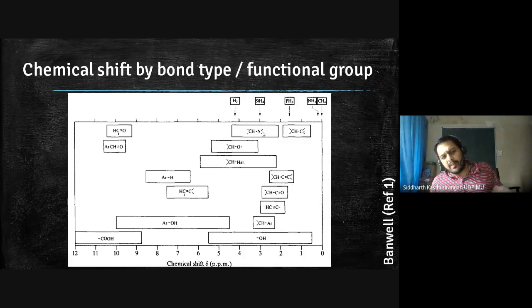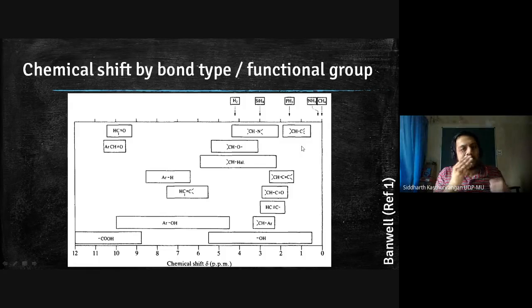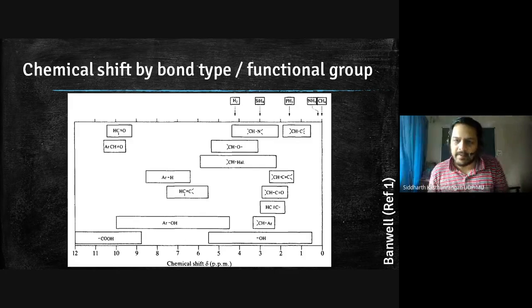These are all normal chain compounds of carbon. All of them will have the same characteristic. All of them will show only the normal chemical shift. It is just a CH kind of thing, and you will not get to know really what its length is, whether it is 5 carbon atoms, 6, 7 or 8.